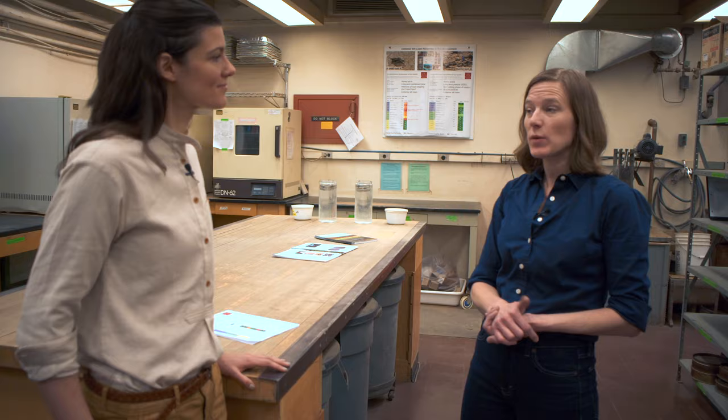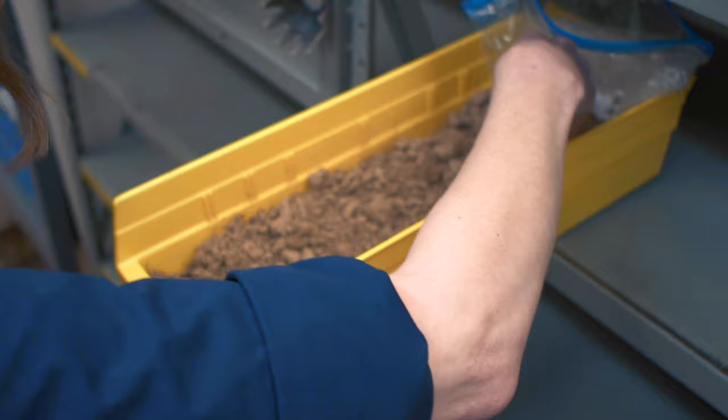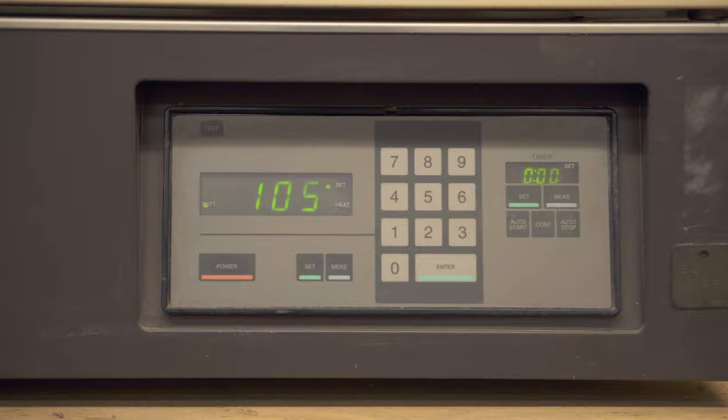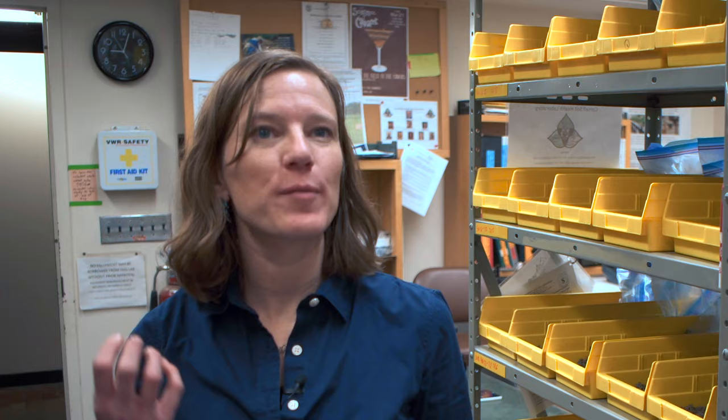We air dry our soil. These came in the last couple days — we lay them out, we break them up, and they sit here for about two or three days before they're totally dry. We air dry it to maintain the biological activity. A lot of soil labs, if you're looking at just nutrients, would dry it in a 105°C oven — that stops everything, and that's fine for nutrients. But if you're trying to look at the life of the soil, we need to keep it alive. There are more organisms in a teaspoon of soil than there are people on the planet — it's an incredibly diverse and active ecosystem that we're just starting to understand.